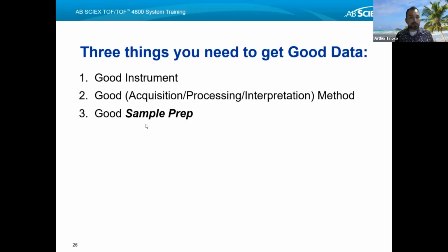And then very important is the process of prepping your sample. This is not trivial, which is why I kept repeating to let me know what samples you want, so I can guide you on this prep, because it's not something that's trivial.